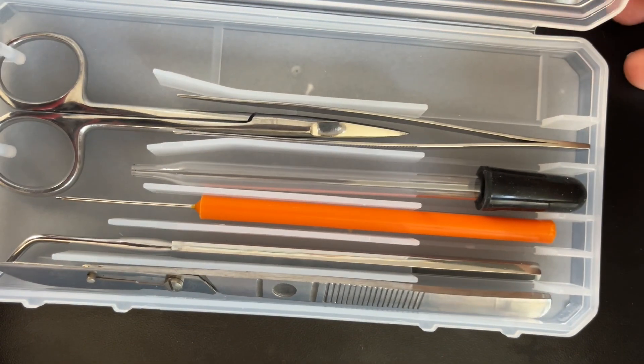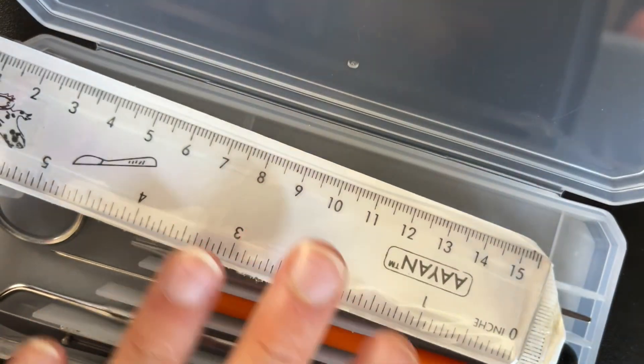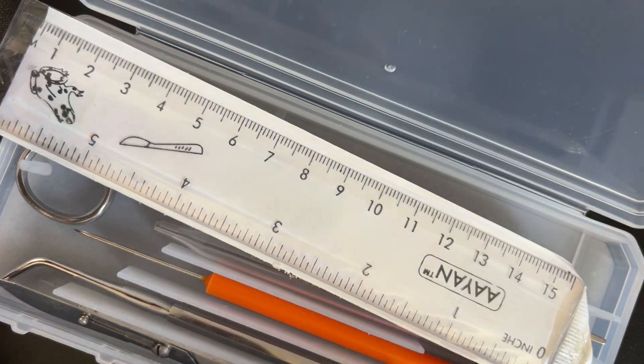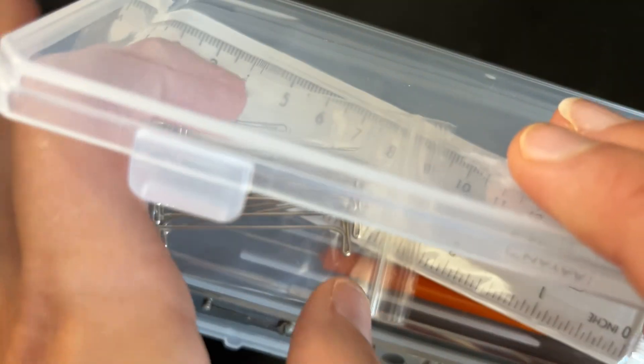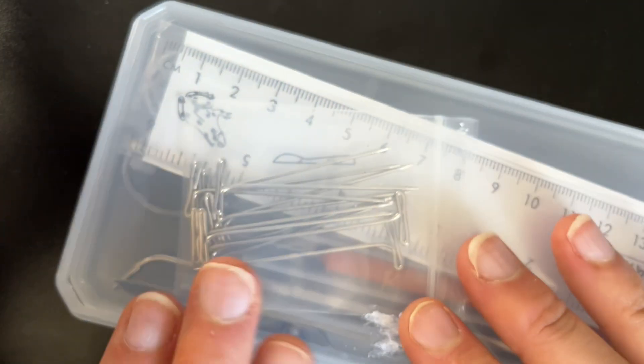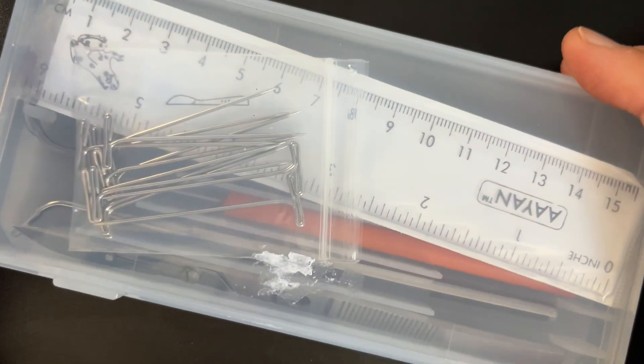Once you're done with the dissection, it's important to follow your teacher's instructions for cleaning and returning the tools to their proper place. Even if this is your personal dissection kit, you want to wash your tools with warm water and soap after every dissection. You might even have sterilization chemicals available in the lab. Thoroughly dry your tools before returning them to your dissection kit in order to prevent rusting and contamination.